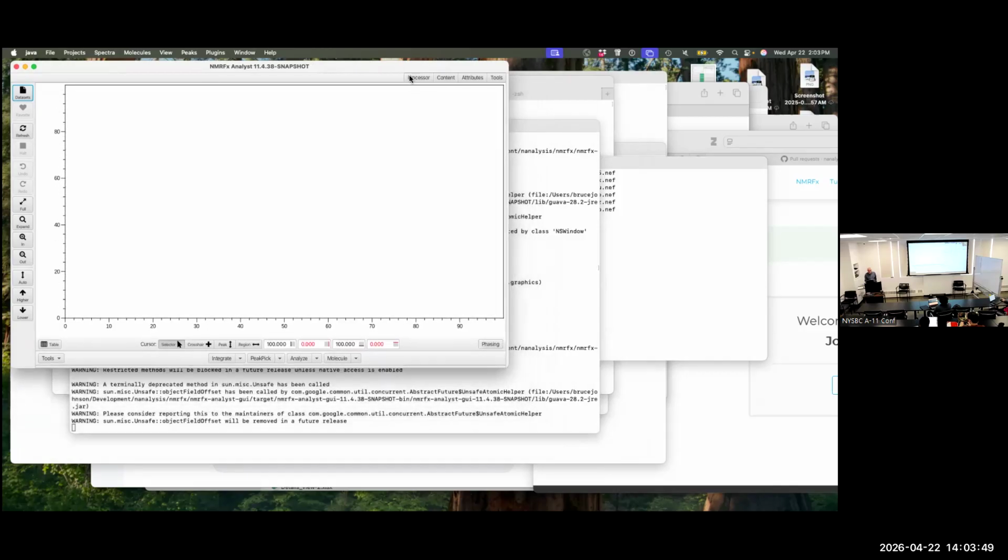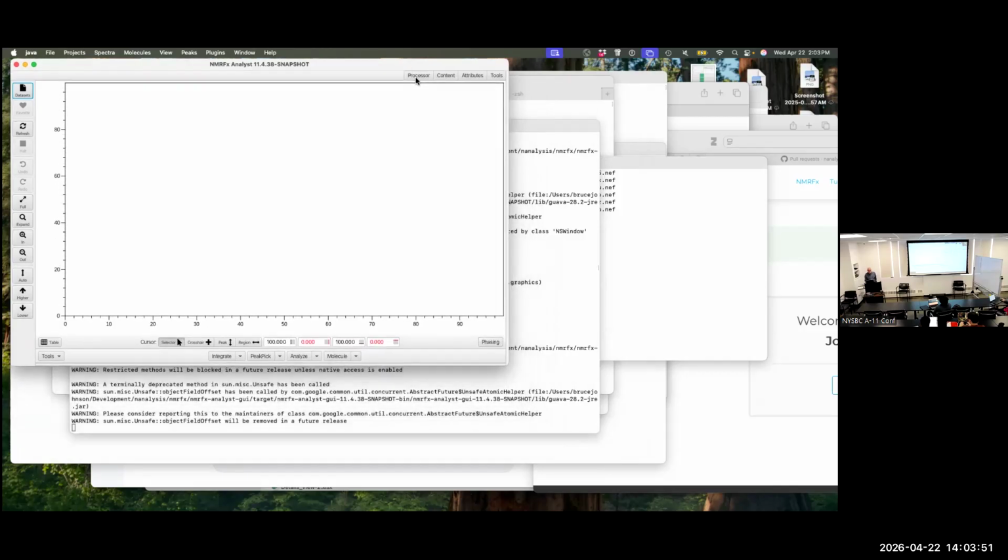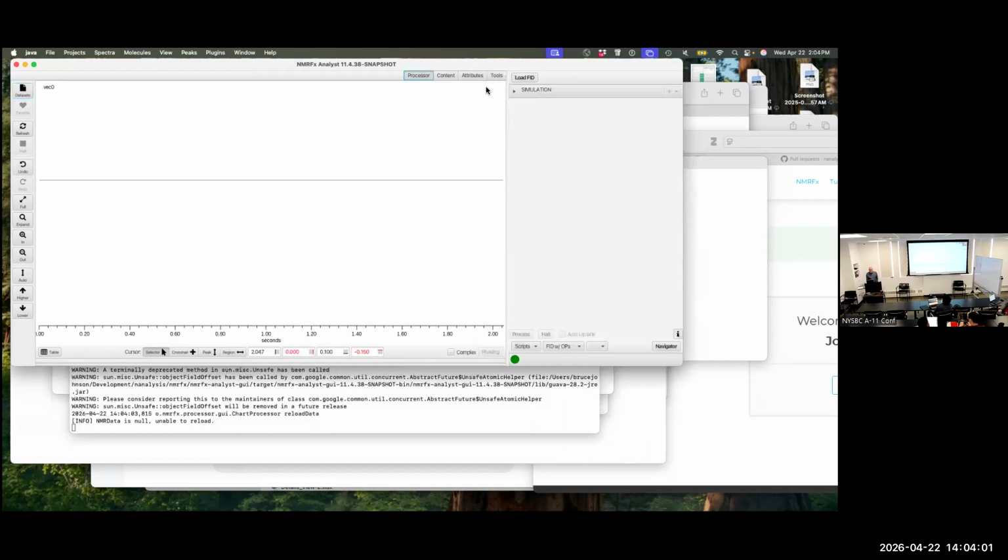I'll try to go through this quickly, but I'd like to talk a little bit about some of the concepts of the processing, just to reinforce maybe things that Art has talked about, or Deanna talked about in class. So if we go to the processor, if you haven't opened up a data set, there's a simulator. Over here under the simulation, you open this tab, and then we have a bunch of operations. So let's just simulate a little bit of data.